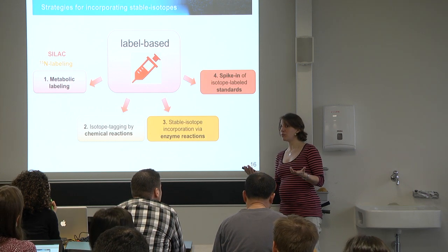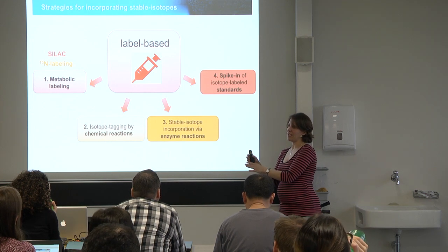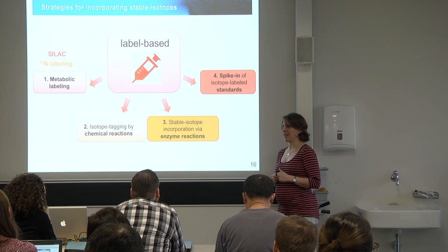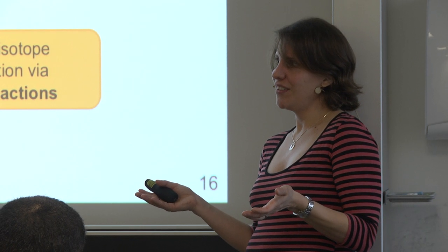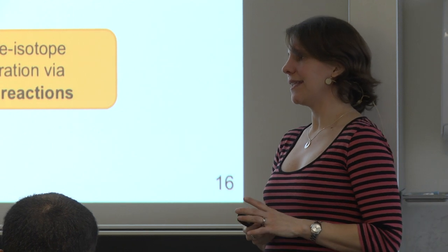And if you do a SWATH measurement, one great value out of SWATH measurements is that you can use this TIC for normalization of protein loading amount very nicely, even if you then just use a few proteins that you're interested in quantifying. With SRM, usually we're very, very limited in data points that we measure, so to normalize over the TIC of SRM measurements is not a good idea at all. There you need to think about something else.